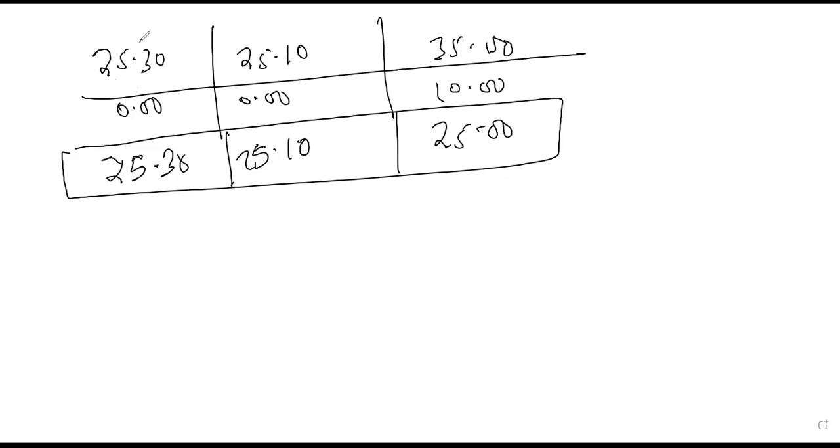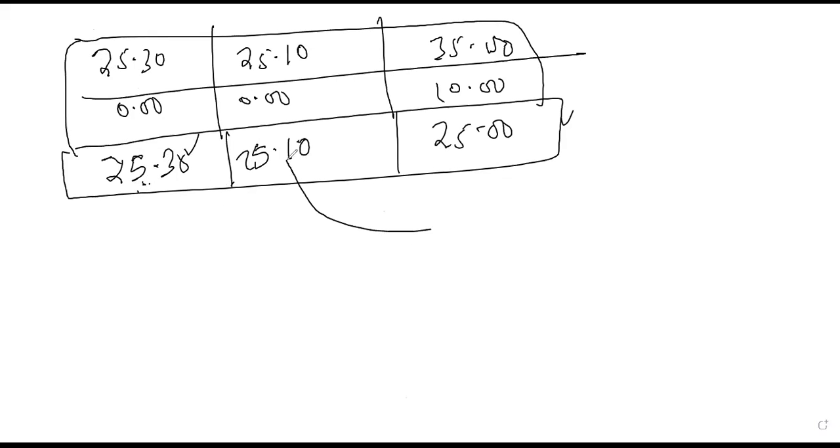Someone was asking, that person inboxed me, that their teacher said the first value is taken to be inaccurate, and therefore it cannot be used to select the values when you're taking the titre average. No. Even this one can be inaccurate, but this one and this one can be accurate, depending. According to the accuracy of the results, of course, we are taking the ones whose error is plus or minus 0.1.